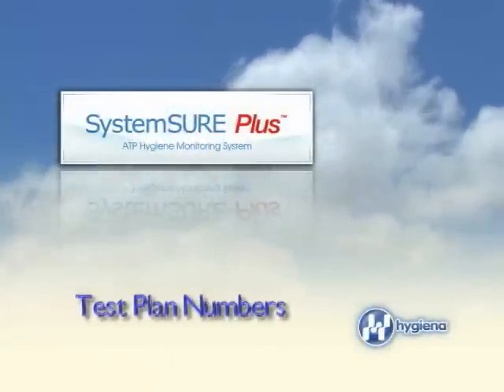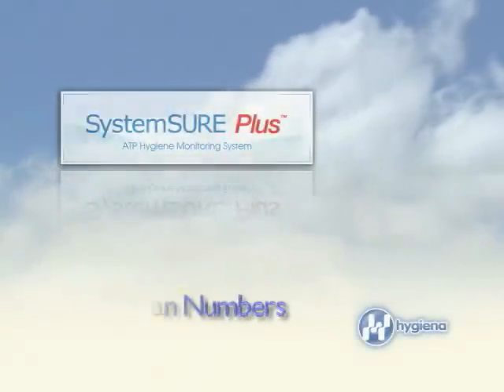Test plan number. After setting up your program number, you can assign a test plan to your location. A test plan is a particular location within your facility where testing should occur. Test plans keep multiple testing locations in order and easily accessible to the user.